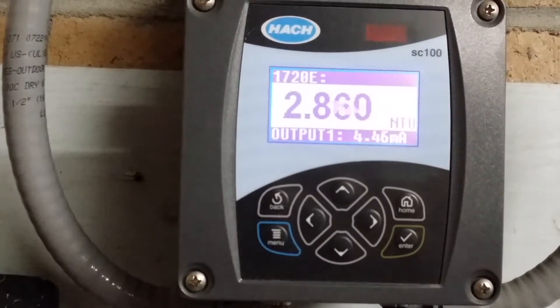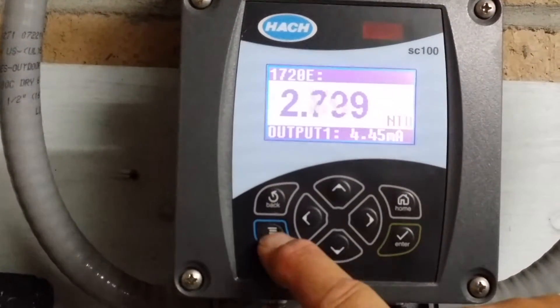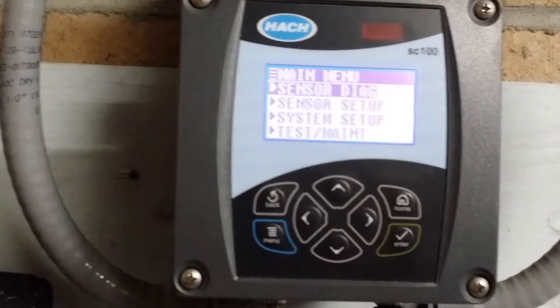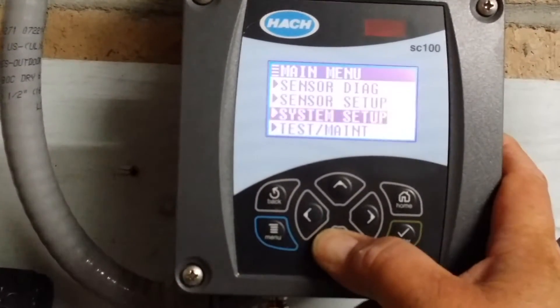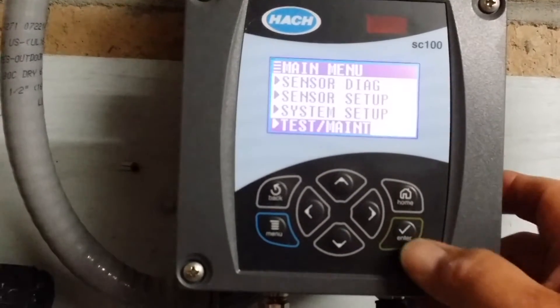First, we'll go to the menu screen. When we hit the menu screen you have several different options. You will scroll down to the test maintenance option and hit enter.